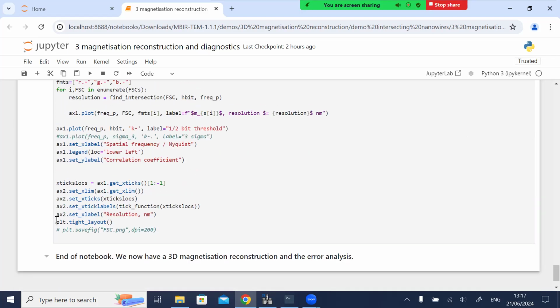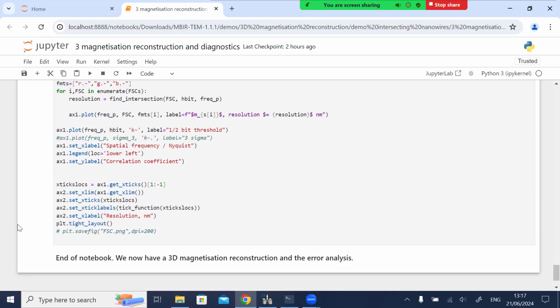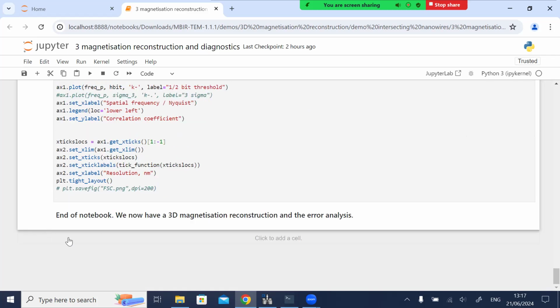And if we want to do better, we would need to use two tilt series, but aligning two tilt series with each other has not yet been automated, and I will include a tutorial on that as soon as I have come up with a generalized solution that should work for most samples.